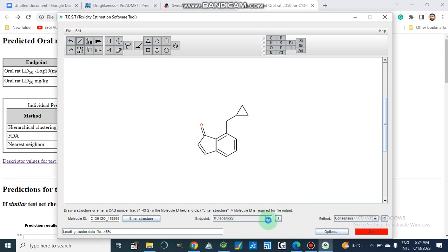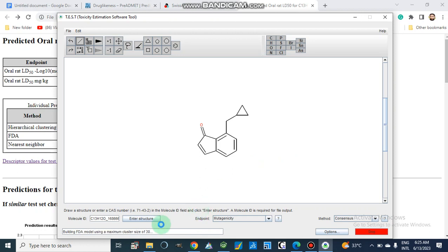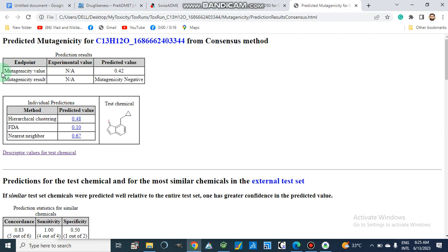It is now running and working on FDA models. The result is now open. The mutagenicity experimental value is not applicable and the predicted value is 0.42, which is negative — meaning our compound is non-mutagenic. These are the predicted values from individual methods, and from the consensus method the mutagenicity is negative with a predicted value of 0.42.